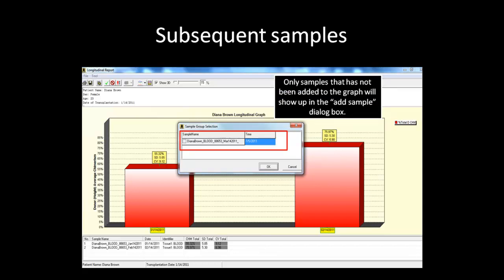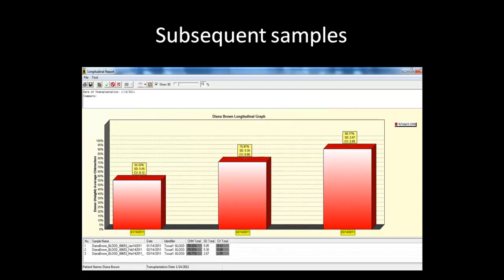Any additional samples added at a later time using the add sample to project tool will be listed in the add sample dialog box of the longitudinal report. Adding subsequent samples to the project was discussed in the first two webinars. Once you have selected the desired samples, ChimerMarker will automatically add the sample to the appropriate location on the graph based on the date specified. This procedure is the same for both single and double donor longitudinal reports.